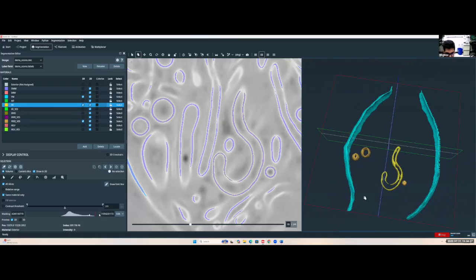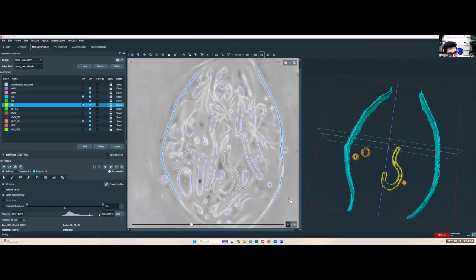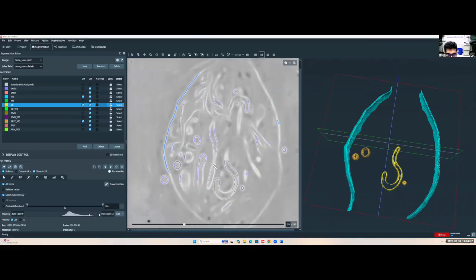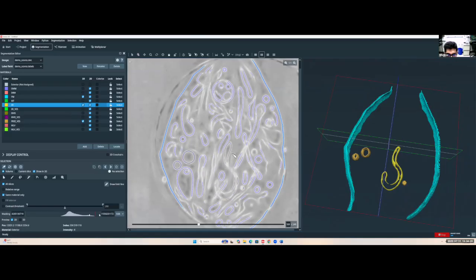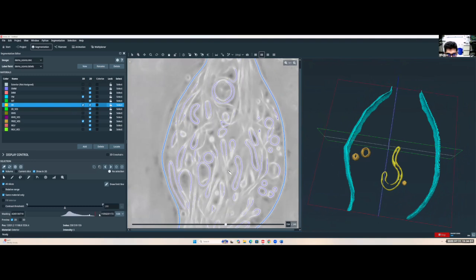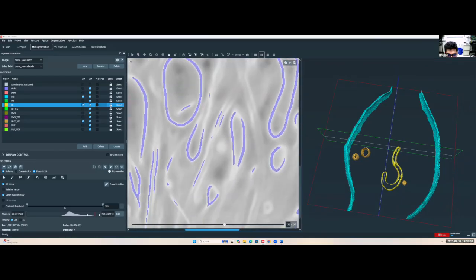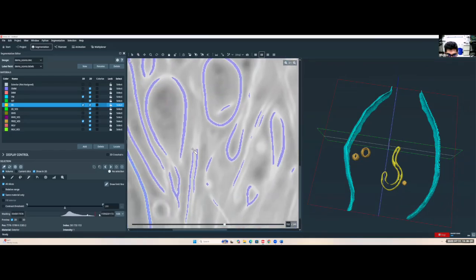So this is the general process of segmenting, and the only question now is, why do I need two files? If I scroll through some of the Z, we should be able to see microtubules being effectively segmented through here. I can be a little bit more liberal with my masking, and I'll start to zoom in down here, and you can see that this microtubule right here, where my mouse is, has been segmented pretty well. So here we'll show why TARDIS is necessary.